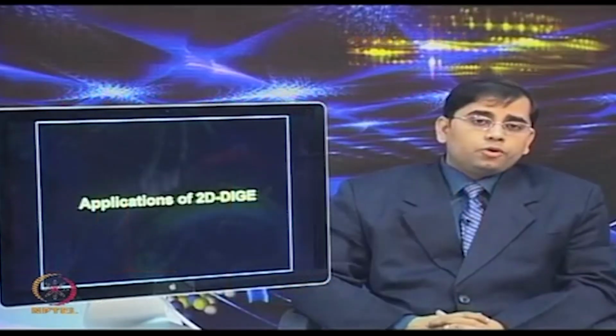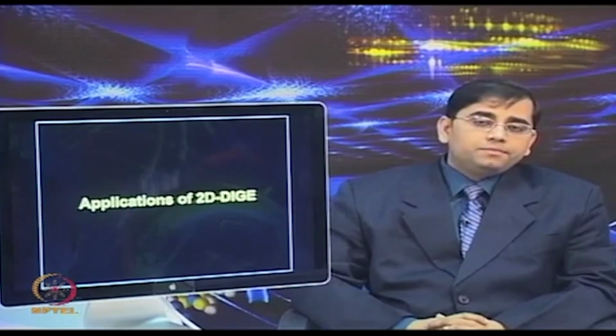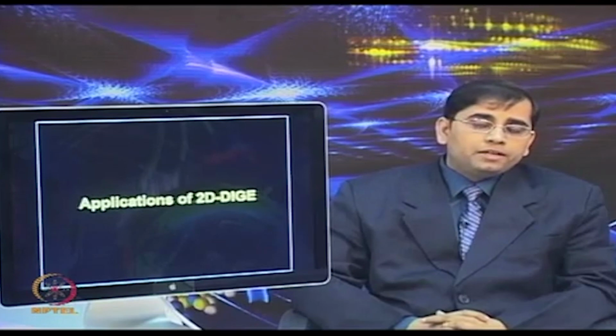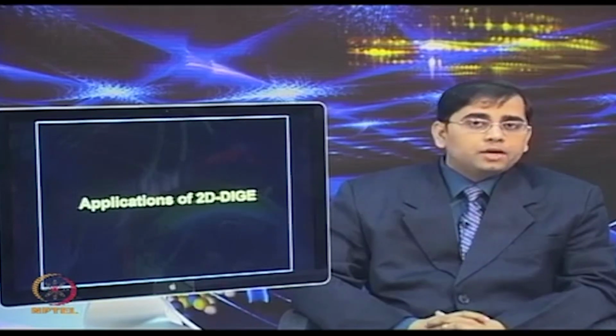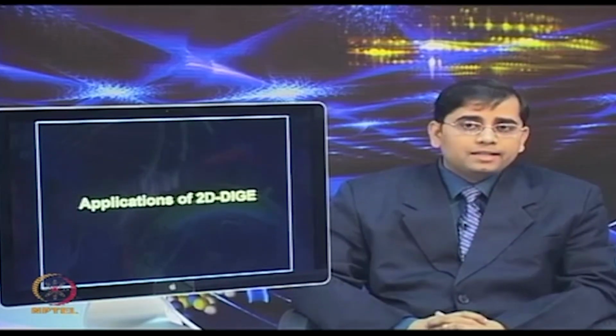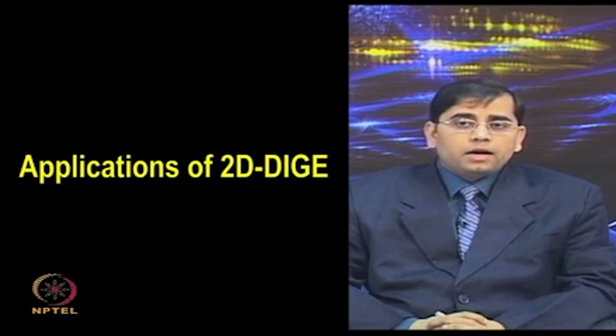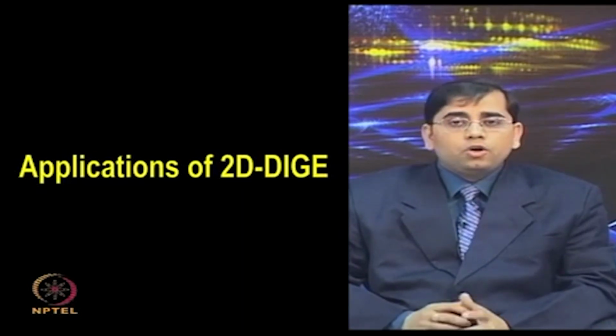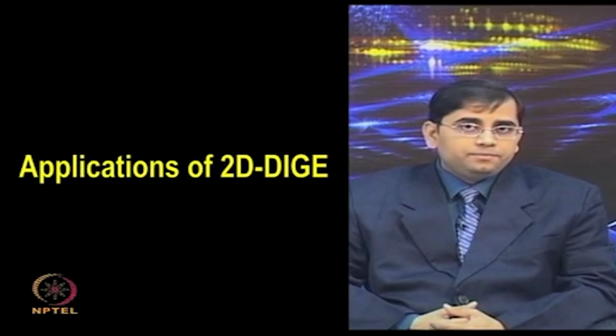So, overall the DIGE method is far superior in terms of reproducibility and quantitative accuracy as compared to conventional two-dimensional electrophoresis. Therefore, applications of 2D DIGE can be found in virtually all major biological research areas.